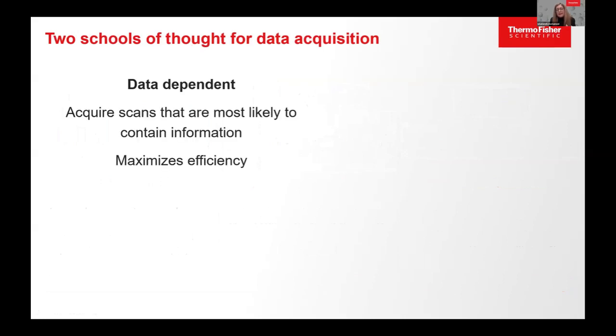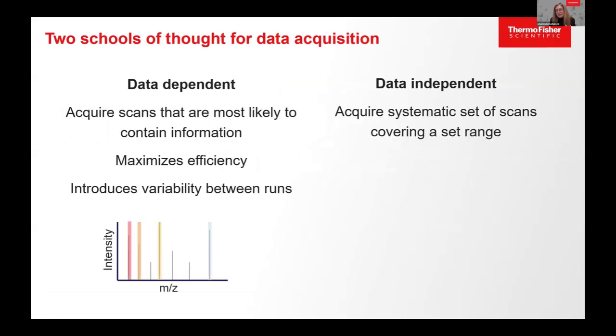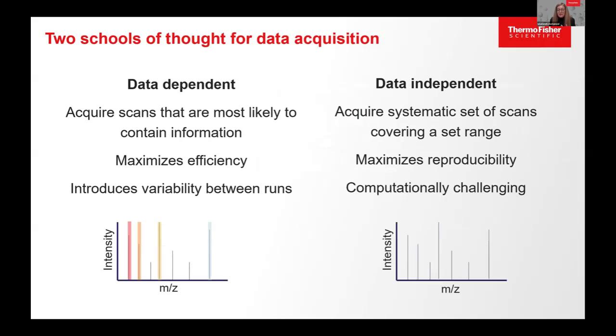I have listed some of them here, but many of you, I think, have seen them already based on today's presentations. One of the things that is really important for me as a proteomics scientist in translational research is missing data, or data completeness, right? Using match-between-runs in DIA or using spectral library gas phase fractionation, as some of your colleagues just presented, are tools that improve your data completeness.